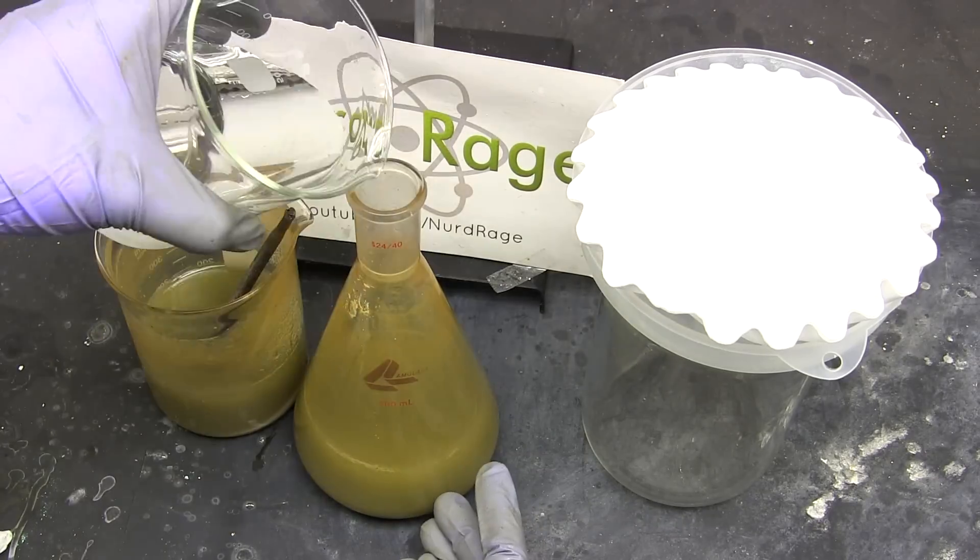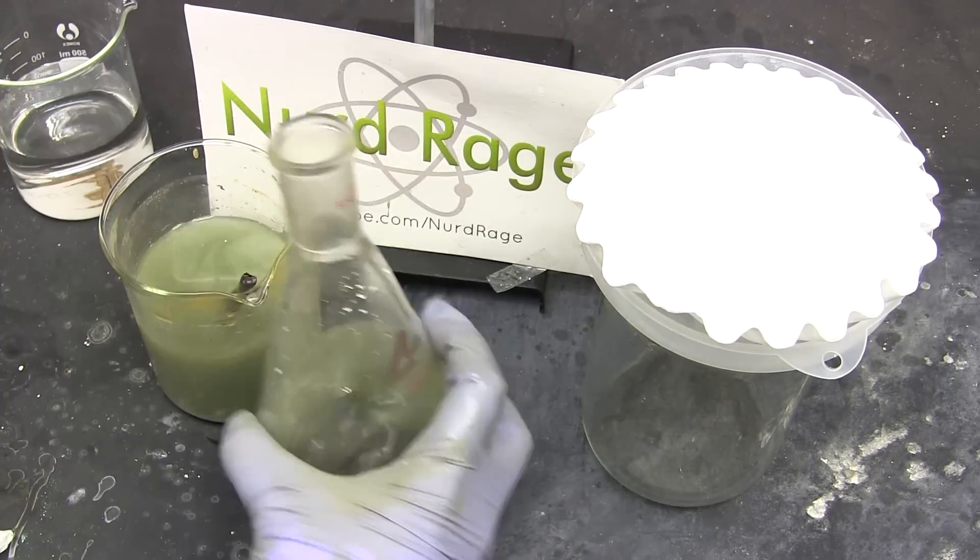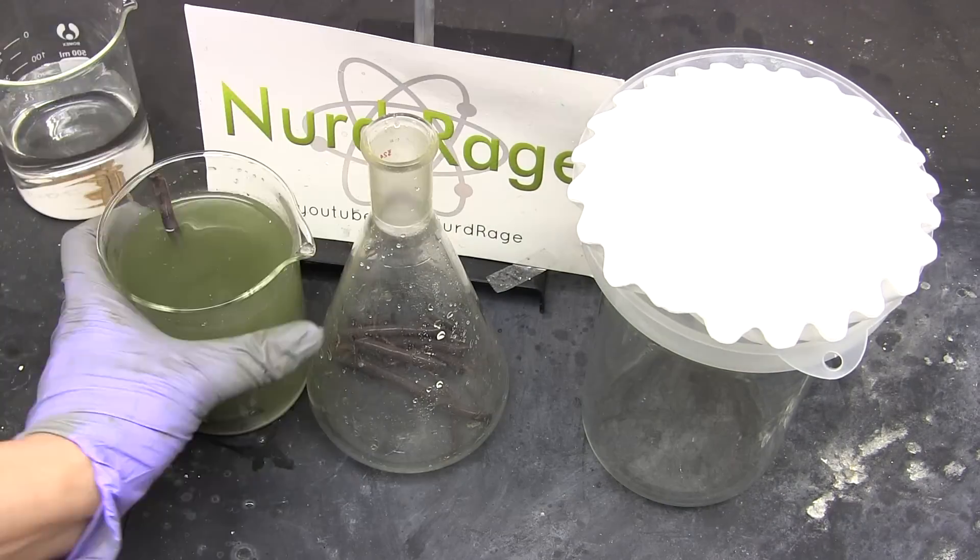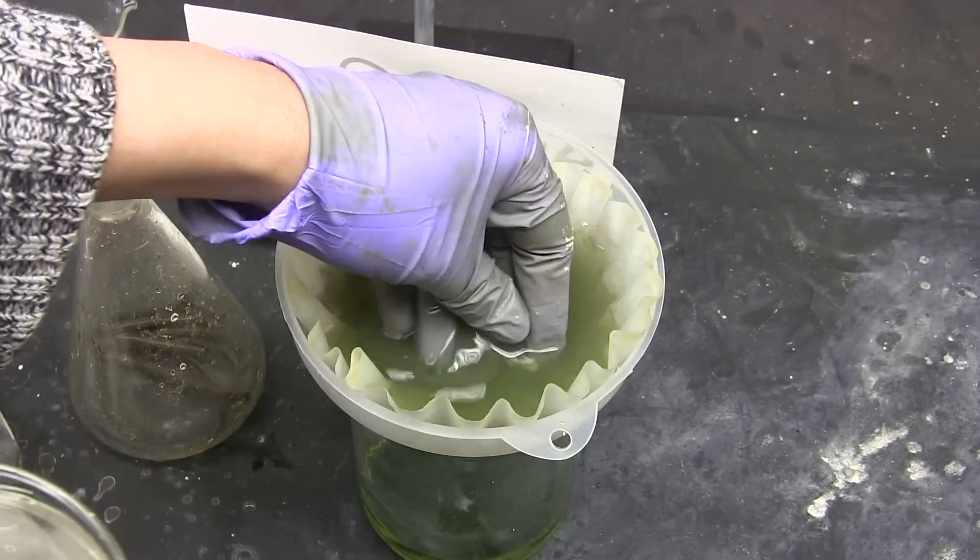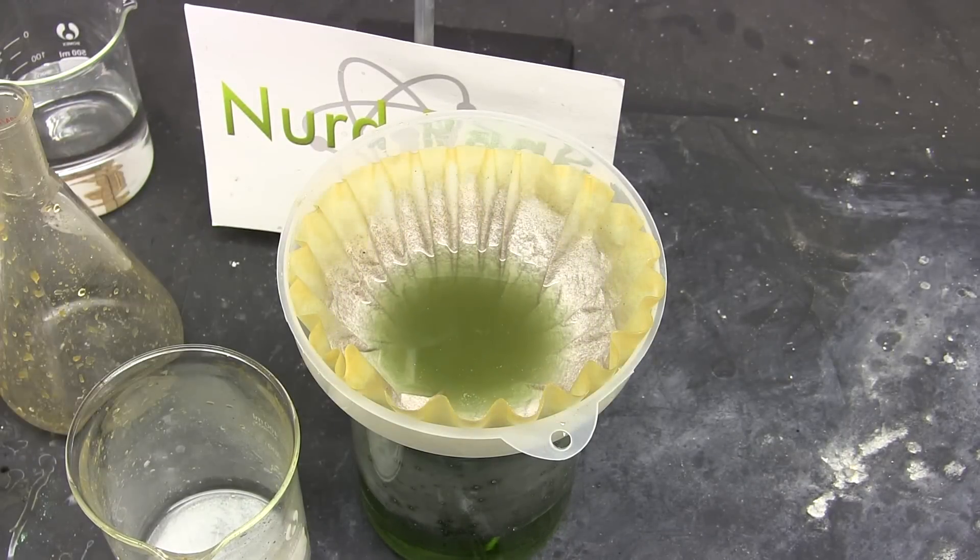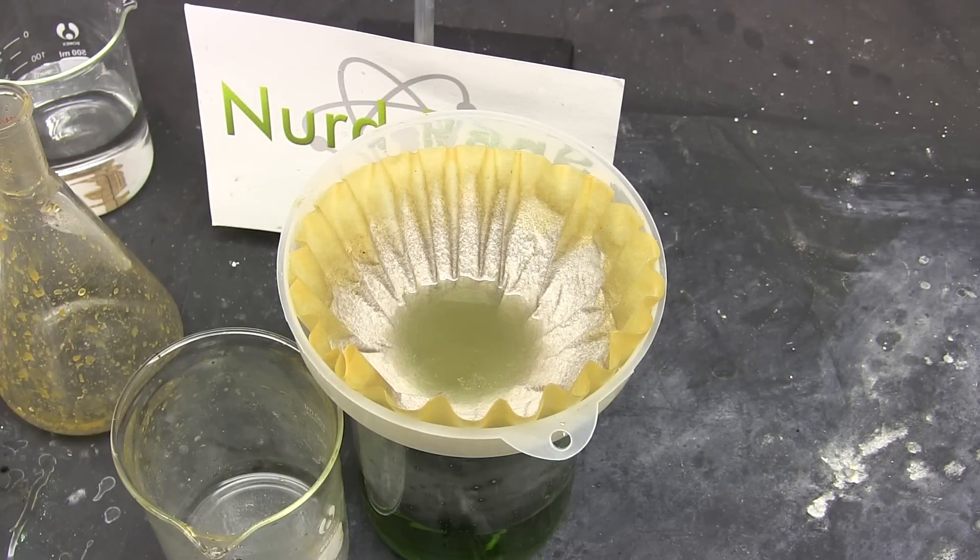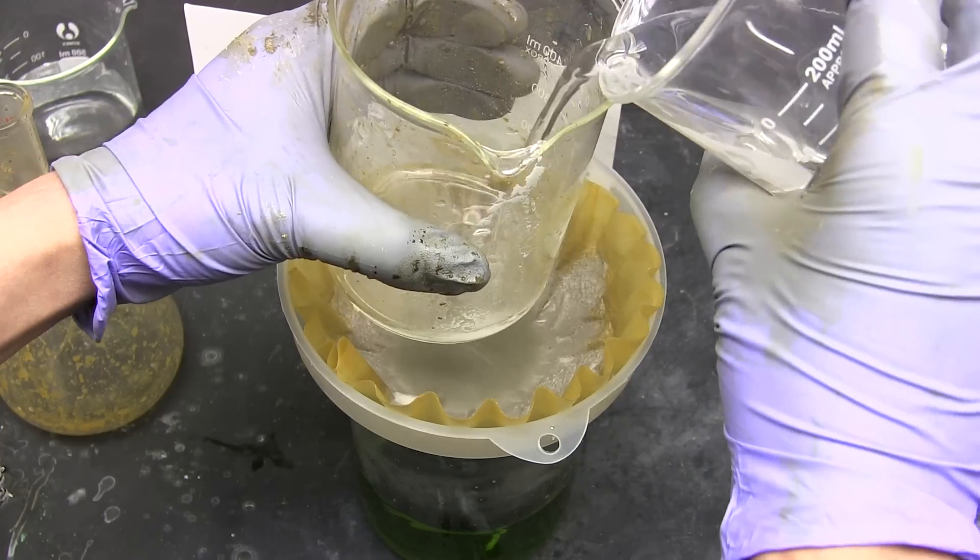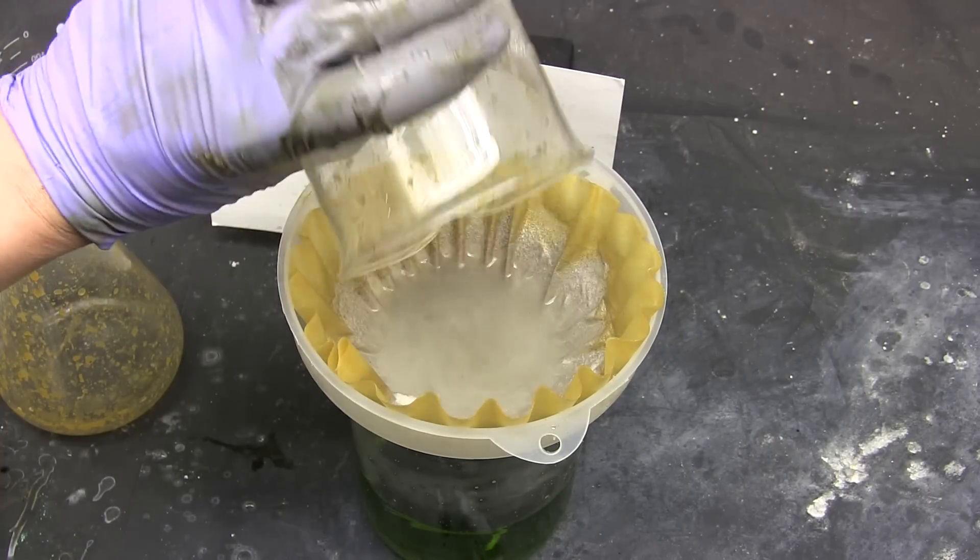Okay now once the solid residue is dissolved and it's just a suspension of fine white particles, filter the solution. At this point we are separating the copper from the iron. You can also take this opportunity to remove any remaining bits of copper metal. Be sure to wash out any remaining residues with water to ensure maximum recovery.